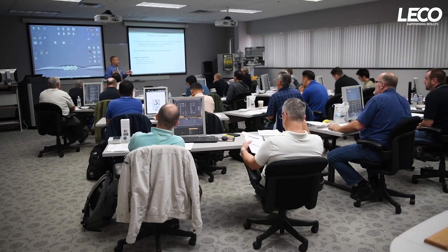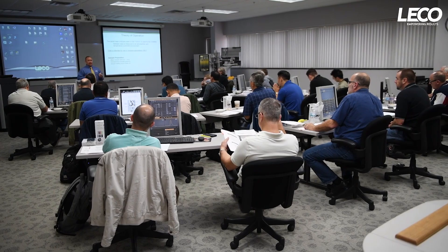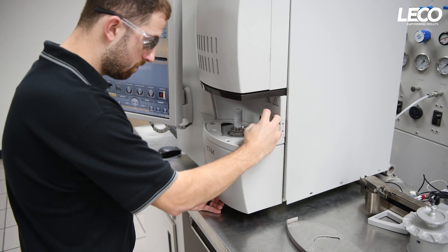LECO's commitment to helping your laboratory be successful doesn't end when you purchase an instrument. For over 80 years, we've remained committed to enhancing your experience long after the sale by offering thorough training on our instruments and technology. Accessibility to our US-based instrument service network with technicians all over the world keeps your instruments in top working order.